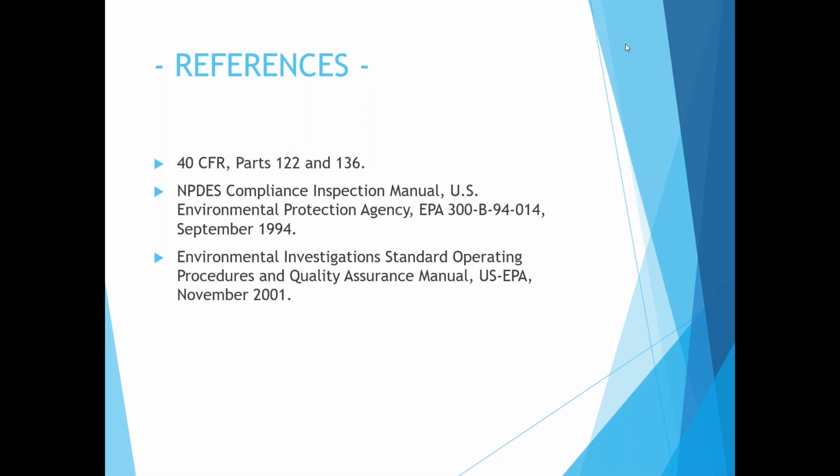Now we're talking about when your inspector or an EPA inspector comes out, we want to see how you do it. So we're going to watch you sample to make sure that you are doing it according to the standards and methods and getting a representative sample. And so we are going to make comments on, hey, there's a better way of doing it.